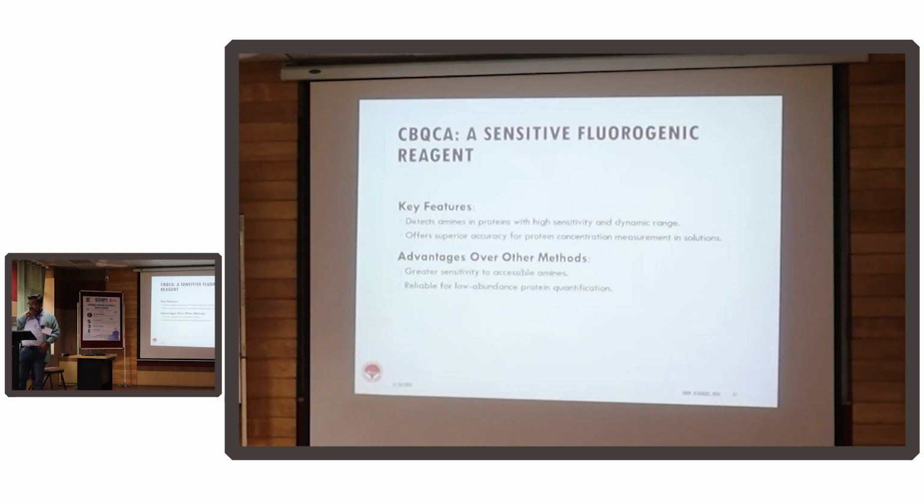There is one reagent called CBQCA, a sensitive fluorogenic reagent. It detects amines in the proteins and it has a very good dynamic range. It gives reliable low abundance protein quantification.